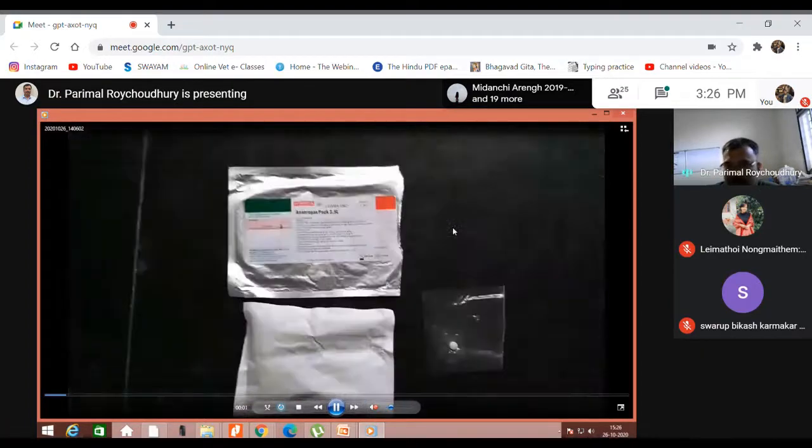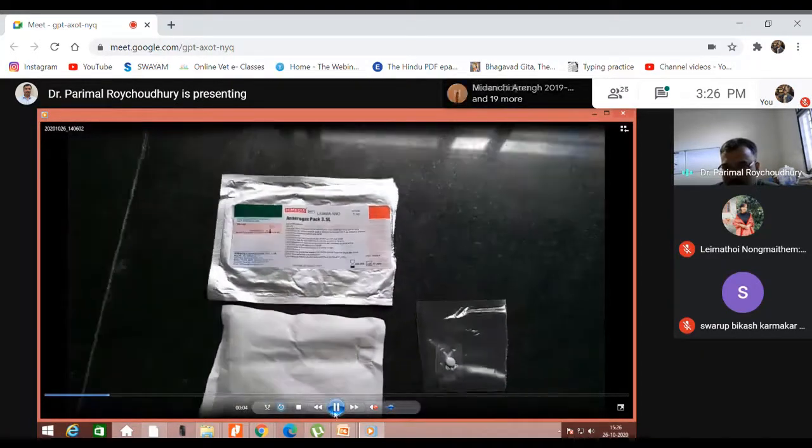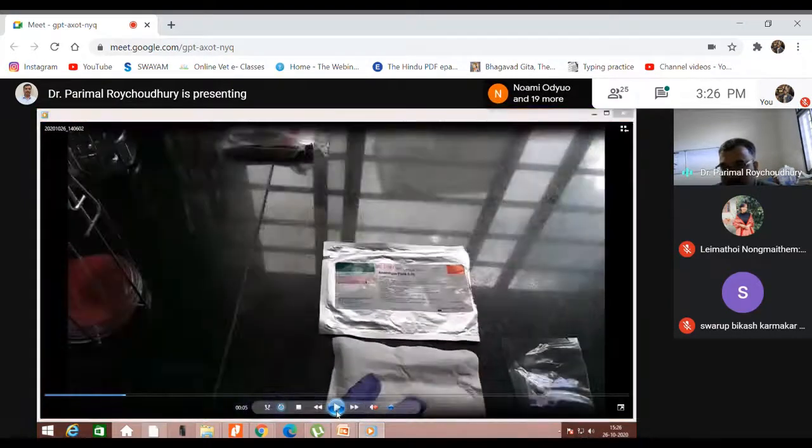If you want to make assurance of total anaerobic condition, we need this kind of anaerobic gas pack system. So this is for 3.5 liters, exactly our container size. Inside this packet is a salt mixture. This is an already used one. I have not used a new one.